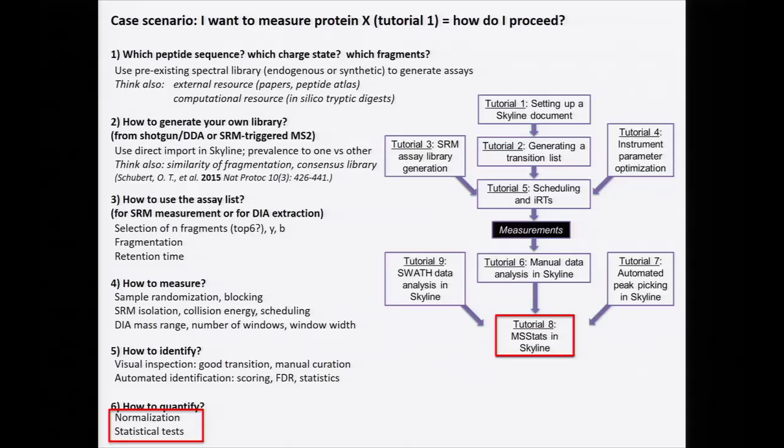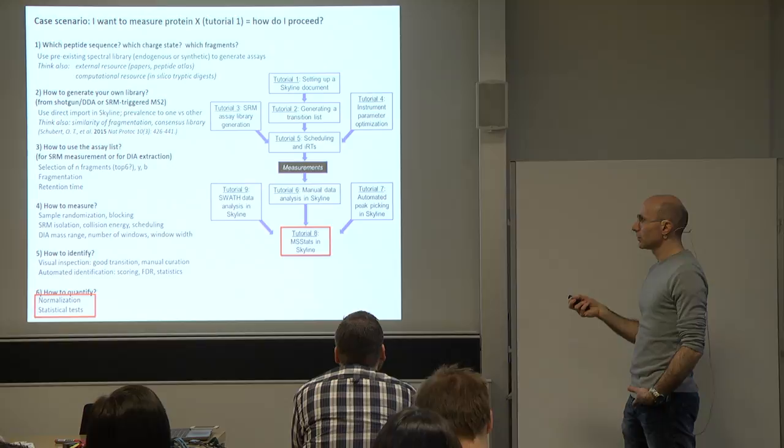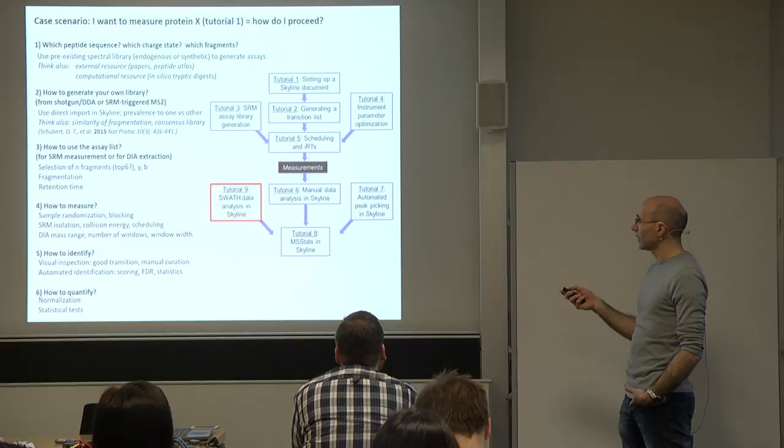So I think with this, you have seen pretty much the entire workflow, from thinking about a protein and a peptide to the quantification after the measurement. And you should have in hand, with all these tutorials and all the things that you have seen this week, when you go back to your lab, the ability to do real high-quality targeted proteomics. I hope you can do that with all these tutorials.